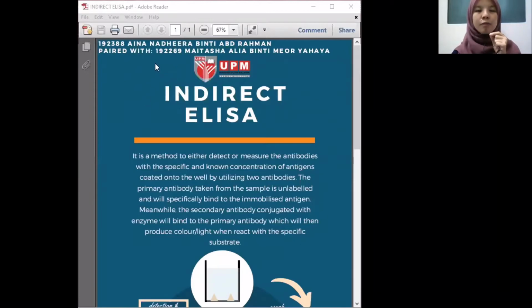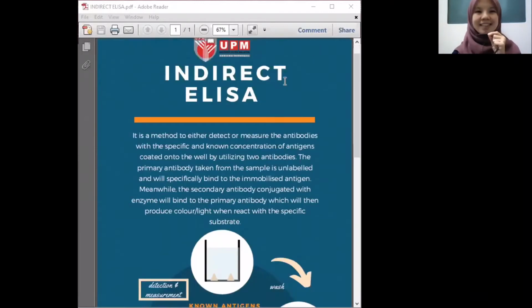We'll talk about the principle of indirect ELISA and the steps, briefly, that are involved in indirect ELISA, while my partner, Maitasha Alia, will explain the other method, which is flow cytometry, in the other video. So now let's start.